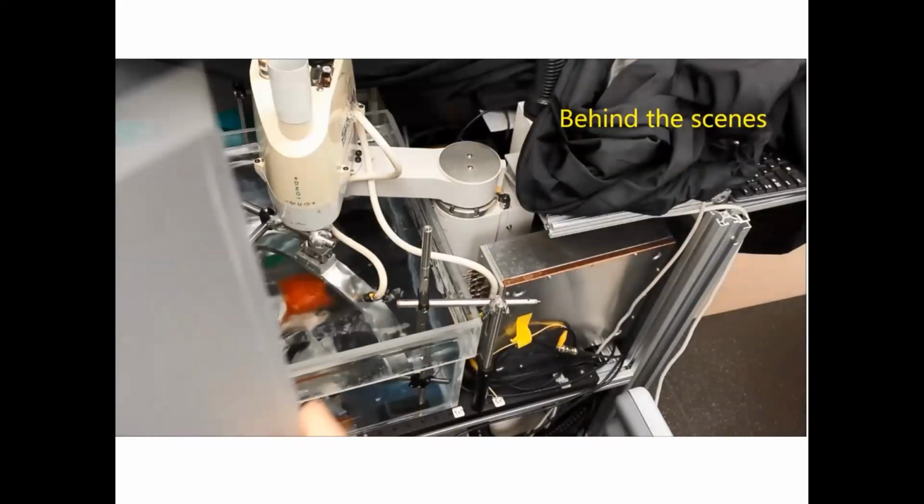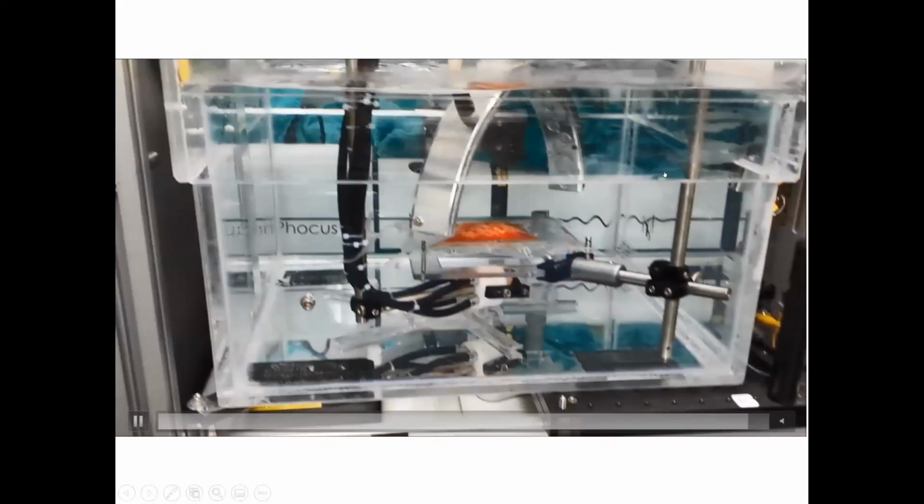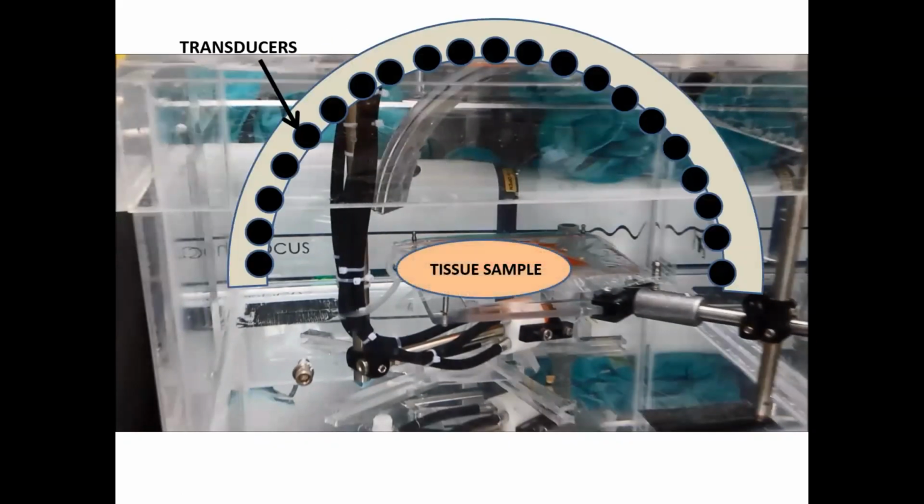Removal of the front panel gives you a better view of the inner workings of this imaging instrument. At this point, without going into too much technical detail, I'd just like to point out that at the heart of the system is a semicircular 24-channel transducer array that was custom designed by our group. Seen here and in the video, it rotates around the tissue sample, which is placed in the center of the array.